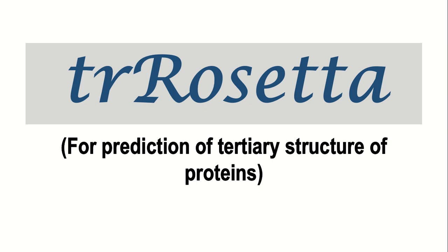Hello everyone. In this video I will show you how you can predict the tertiary structure of a protein. For this we can use a very useful tool called TR Rosetta. It is one of the most cited tools used for predicting the tertiary structure of proteins. How to use this TR Rosetta tool and how to analyze the results will be covered in this video.